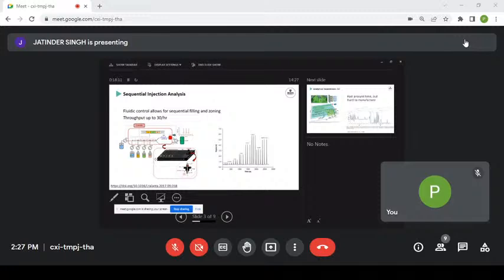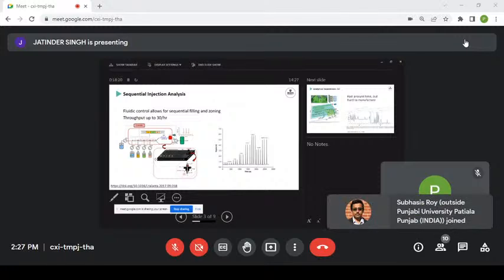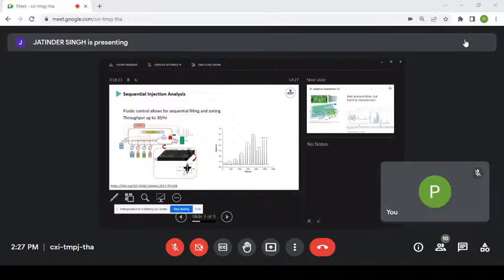So we then open this one, a little bit of that reagent, we can flow into the channel. We open the next valve, and that way we can put the different liquids in the channel in that order. And we can also make sure they've got good boundaries. As you can see here, our sample is sandwiched between the two reagents that it needs to give its color reaction.